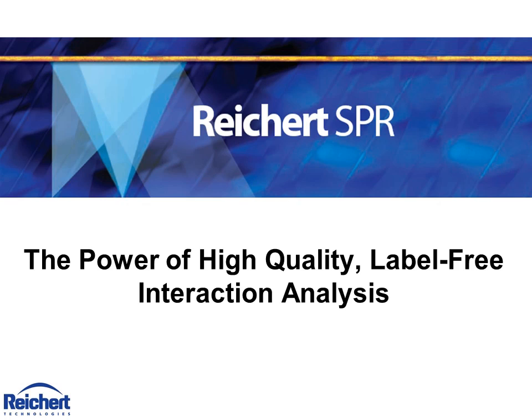Today I will cover the theory behind surface plasmon resonance, review some data examples, and look at the unique problem-solving aspects and features of Reichert's SPR instruments.